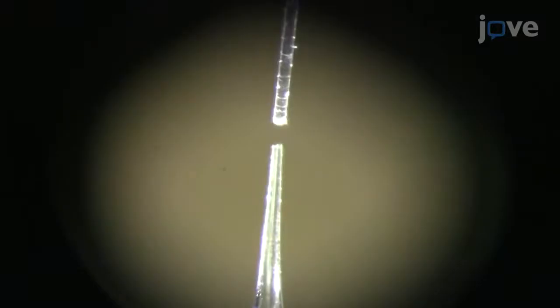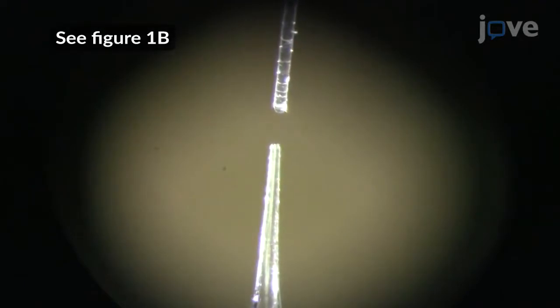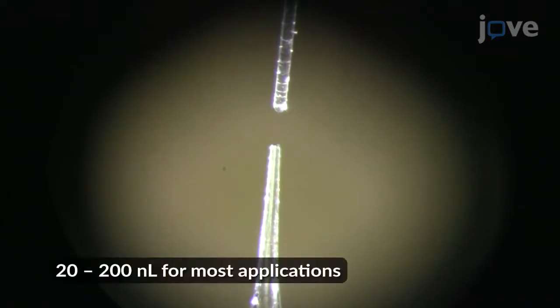Next, observe the bolus of silk AAV on the flat surface, which appears as a liquid dome that dries to a flat film within approximately one minute. Repeat the previous steps until the desired amount of silk AAV is deposited.